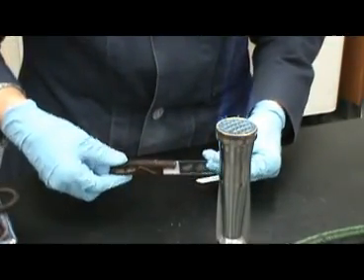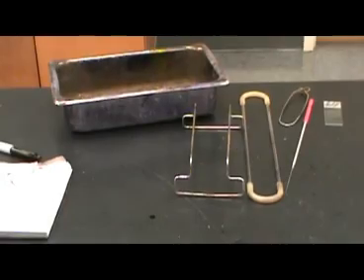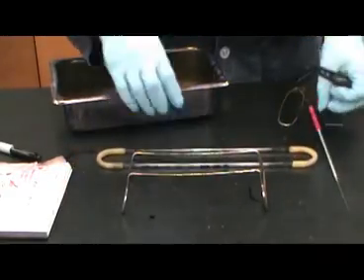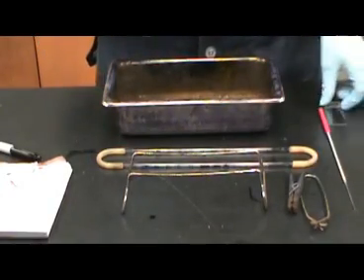After air drying, the slide is then heat fixed. Heat fixing simply involves running the slide through the flame very quickly 2 to 3 times. Heat fixing will kill any bacteria that are on the slide and aid in adherence of the bacteria to the slide so they will not come off during the rinse process. Once the slide has been heat fixed, you are now ready to begin staining.